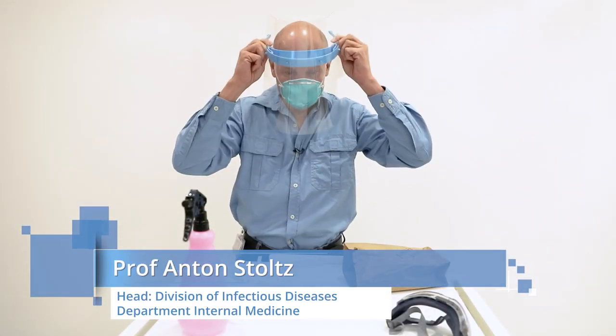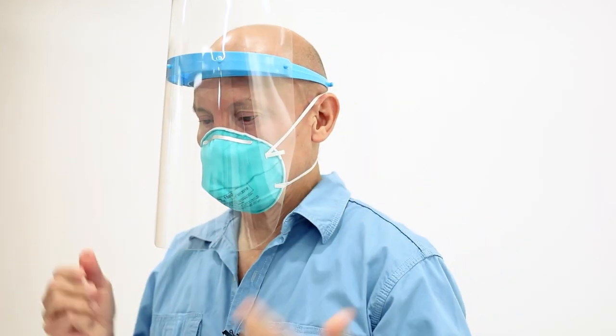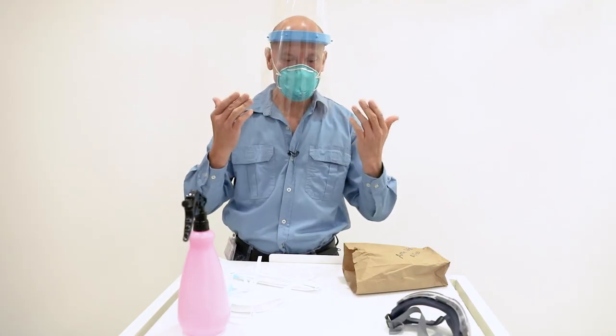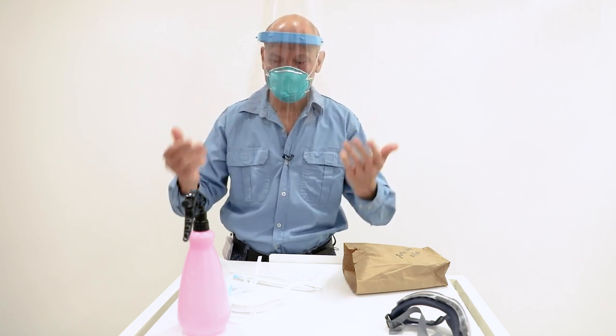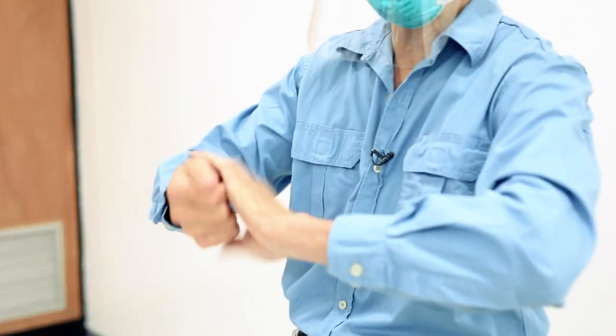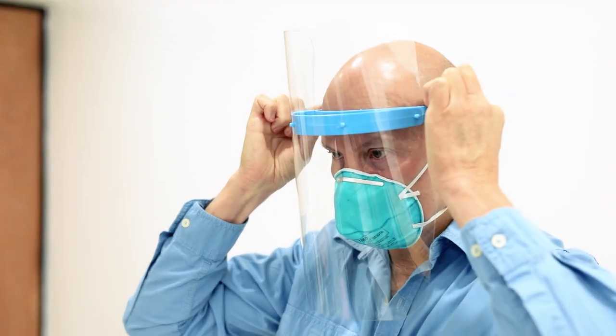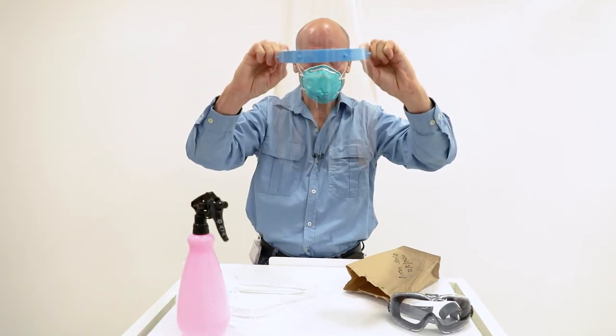The fitting, or donning, of this is not that important. You can have an elastic band at the back, but what is important is the removal. Make sure that your hands are very clean when you remove anything that's near your face. What you will do is touch it, pull it to the front and upwards, and away from your body.